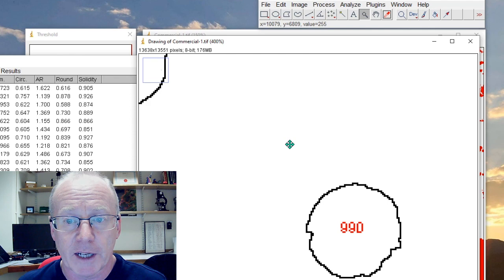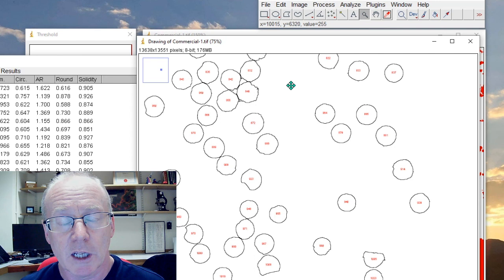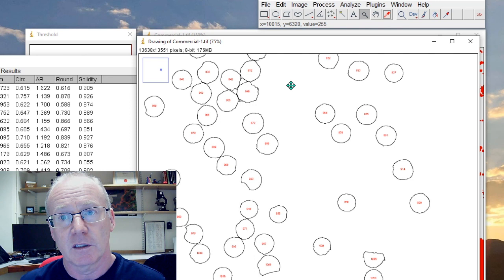So threshold the object, segment it to binary, use the watershed algorithm to split touching objects, threshold that result, and then go to analyze particles and set the parameters that describe the shape and the size of the objects that you want to extract. And hopefully you get a nice result.